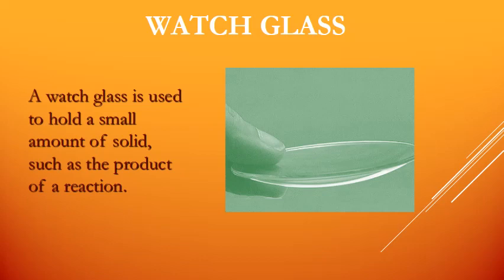A watch glass. A watch glass is used to hold a small amount of solid, such as the product of the reaction. It's also used to cover beakers, and it's usually made of glass.